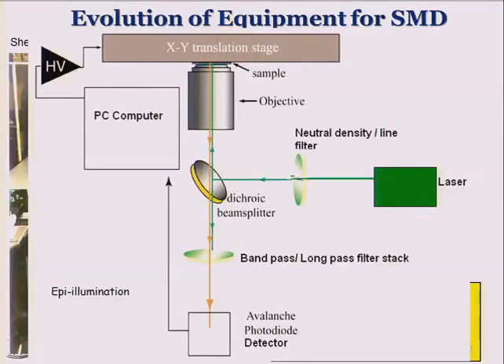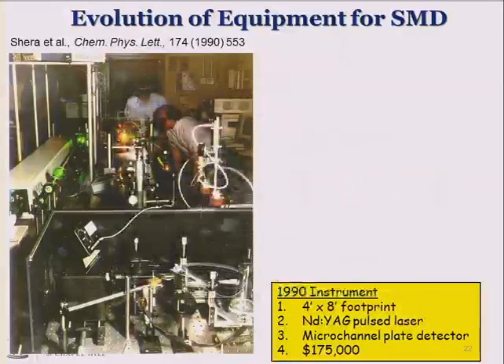All right, so not just the chip is important, but the peripherals around that too. And one of the cumbersome things with doing fluorescent single molecule detection is the extensive amount of equipment that's required to do that. And this is when I was at Los Alamos National Laboratory, this is the instrument that we put together in order to do single molecule detection. Not very transportable into the clinic, I agree, especially in the field.